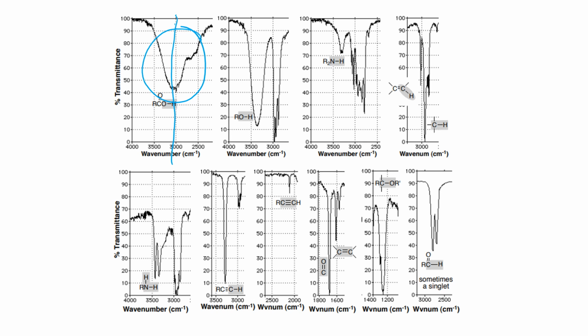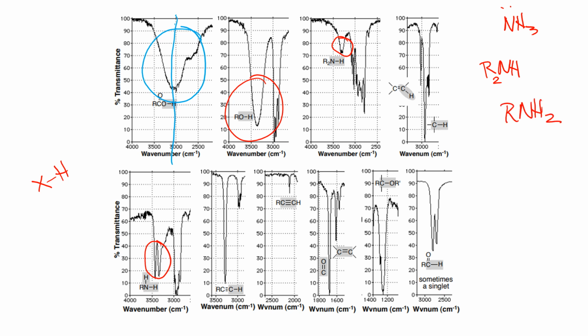So now here you have the alcohol band. Again, these are hydrogens attached to something. And here you have hydrogen attached to nitrogen. In this case, notice this is a secondary amine. If this is ammonia, in the secondary amine you will replace 2 of the H's by R groups. So you only have one N-H stretch, so that's why you see only one band like that. But when you have the primary amine, you have 2 H's here. Because of that, you see these 2 peaks.